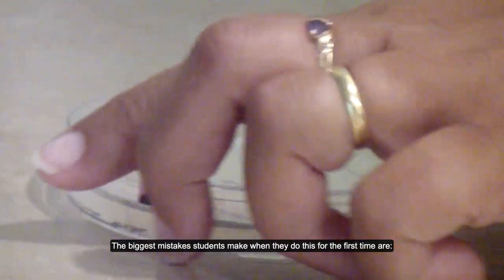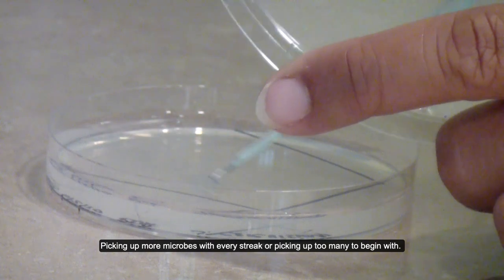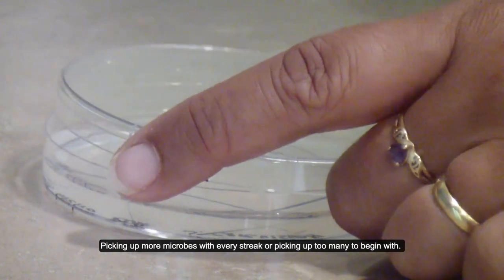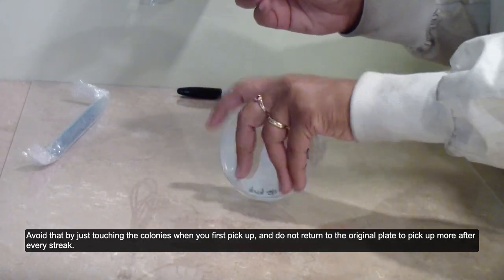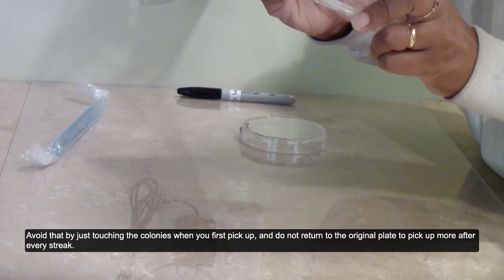The biggest mistakes students make when they do this for the first time are picking up more microbes with every streak or picking up too many to begin with. Avoid that by just touching the colonies when you first pick up and do not return to the original plate to pick up more after every streak.